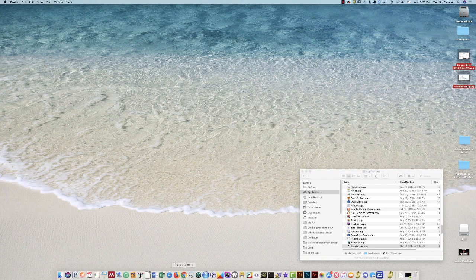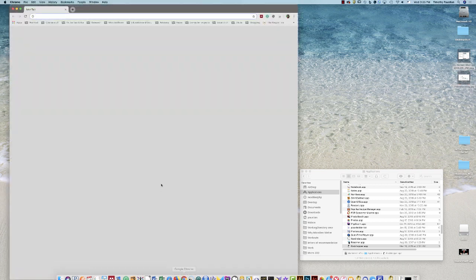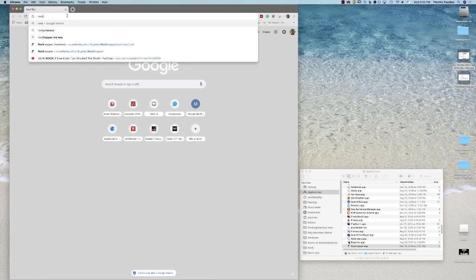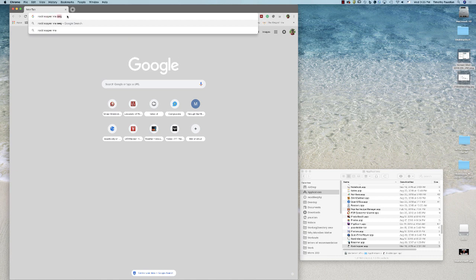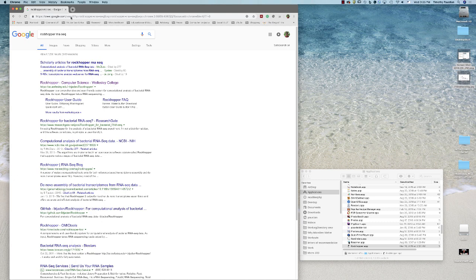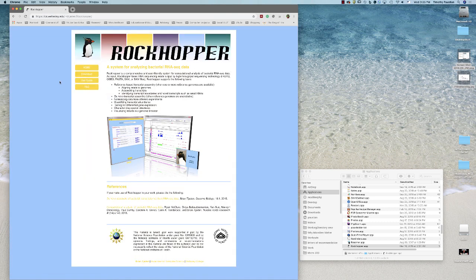First of all, to use the program, you've got to go get it. So get your web browser, go up and search for RockHopper and RNA-Seq. This will take you to a website that is part of the paper that's listed, and this is a system for analyzing bacterial RNA-Seq data.